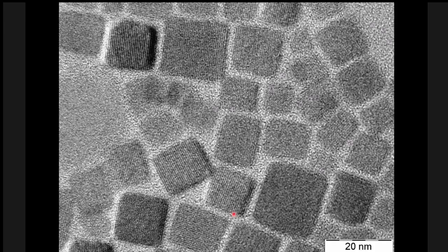Okay, good. So this is a picture of nanocrystals. I'll tell about this. These are perovskite cesium lead bromide, CsPbBr3 nanocrystals. Now here, I want to point out, for example, if I look at this nanocrystal, you see that the atomic planes, whatever these lines we are seeing, are perpendicular to this edge.